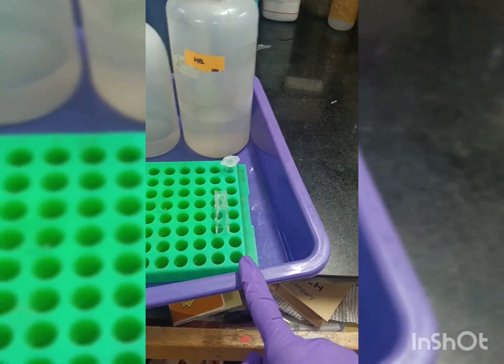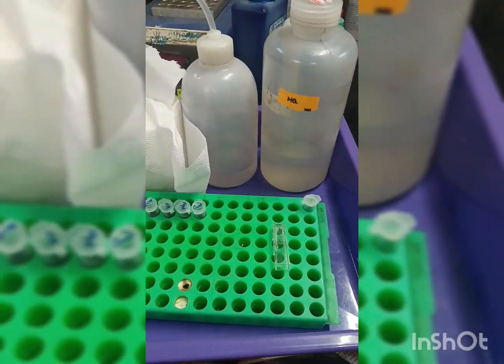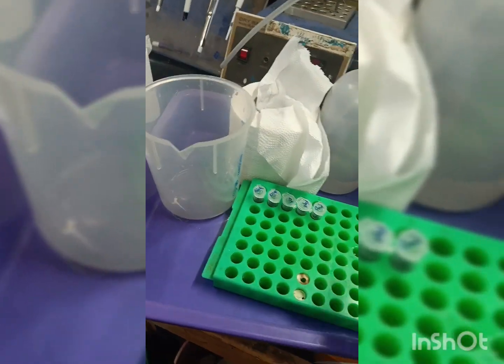For measurement, I need the protein sample and I need the cuvette. This is the cuvette. Make sure it's cleaned properly with alcohol and water. I need Milli-Q water, alcohol, tissue paper, and for discarding the waste water, I need one beaker.